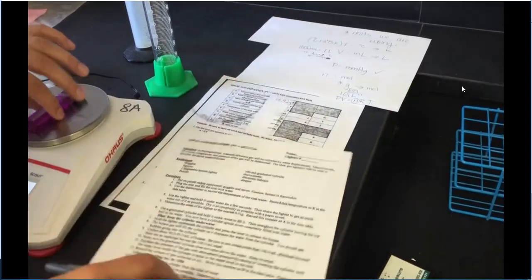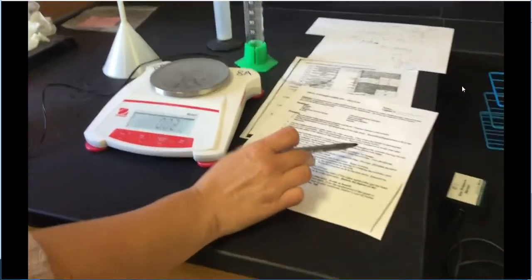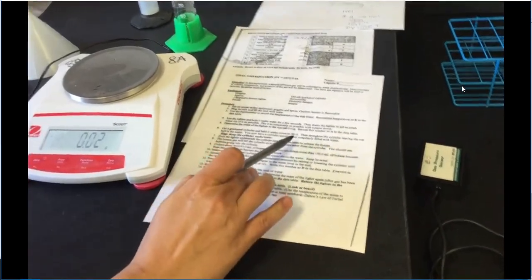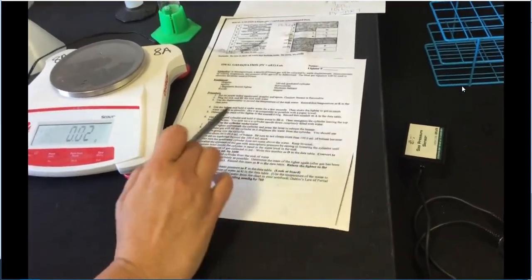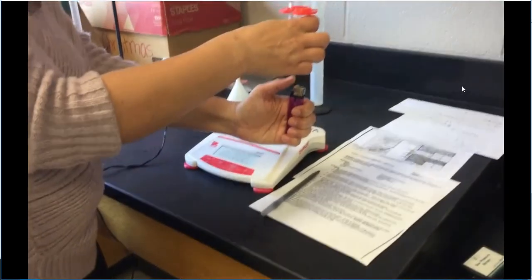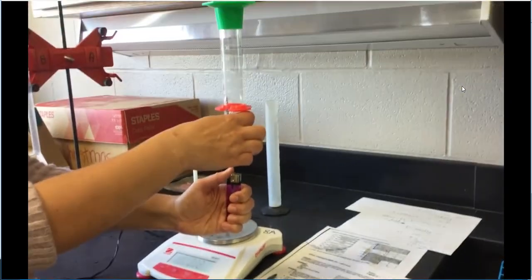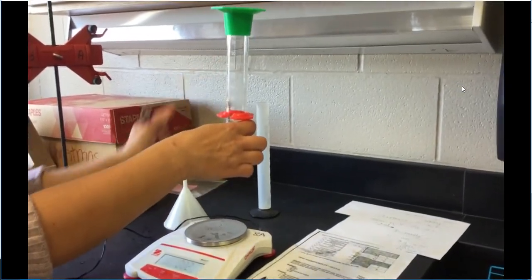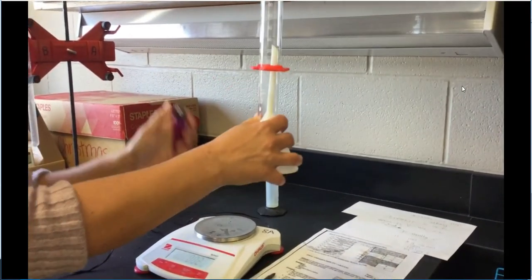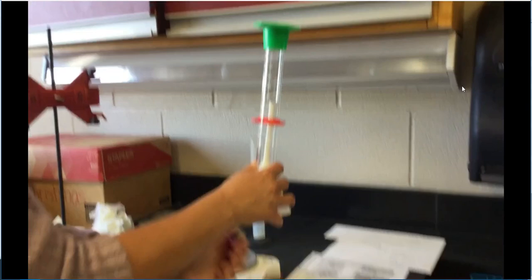Okay. Now we're going to move on. So get a graduated cylinder, hold it underwater, and fill it. We're going to straighten the cylinder, leaving the top half in the water. We now have a cylinder upside down, completely filled with water. So we're going to do that in a second. Then we're going to put that lighter underneath it, kind of like so. Okay? And so with that, that'll be ensuring that the bubbles are going to go in. Those bubbles are representing a gas, just like when we had reactions, right? So we're going to use the funnel to really funnel it into the graduated cylinder.